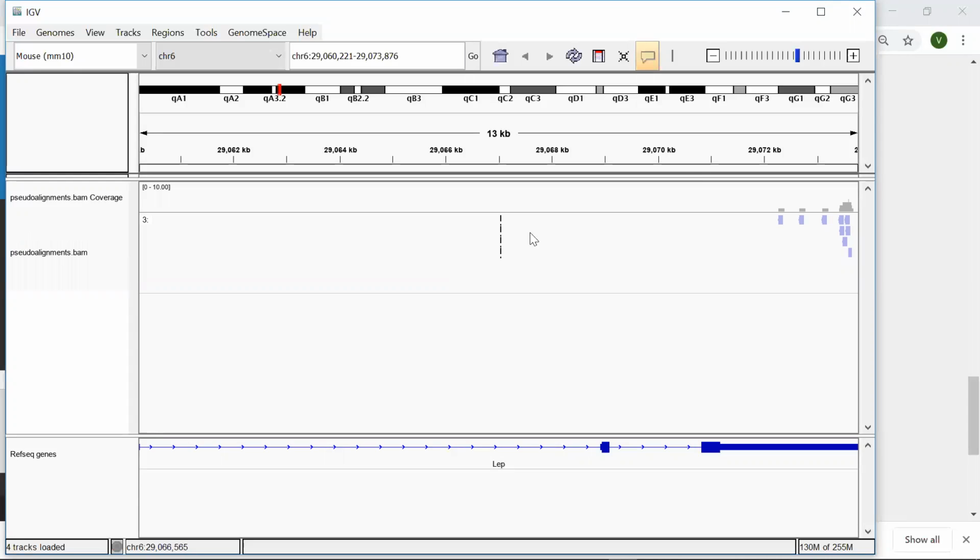Okay, is there anyone having trouble with any of this so far? Maybe you could mention in the chat if you're having trouble. But for me, you can see some of this stuff aligned.